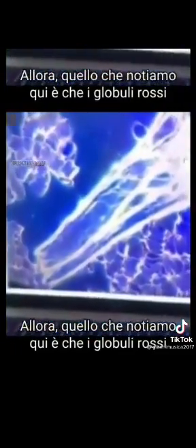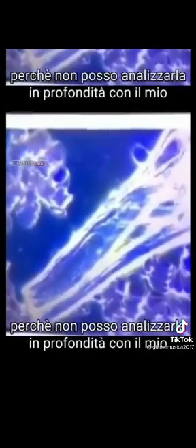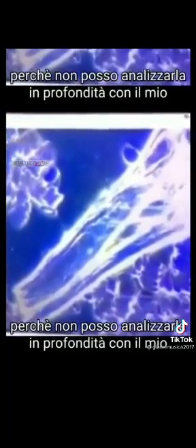So what we see here, that the red blood cells are all stuck on each other, so they stick like pancakes, we could say. But it's a coagulation problem, so they're stuck on each other. And what we also see is this big thing here in the blood, which I cannot explain exactly what it is, because I cannot analyze it deeper here with my equipment, but I can assume it's a graphene oxide or something. So have you ever seen this before?